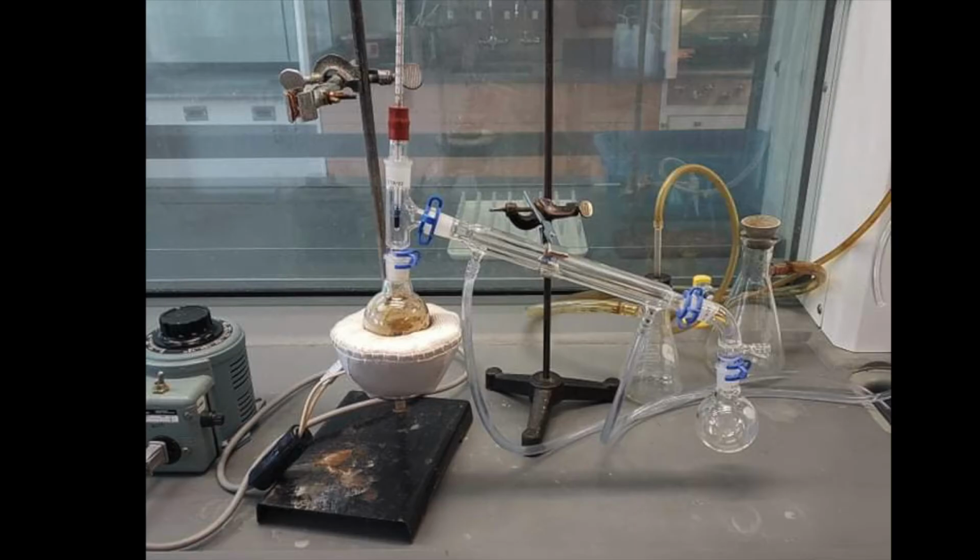While your spice is soaking, you can set up your distillation apparatus. Place your round bottom with your spice and water in it into the heating mantle. Fit it with a Y-shaped tube that also has a thermometer. The Y-shaped tube will then fit into your condenser. Remember, water goes in at the bottom and out at the top. The condenser will then be fit into the curved vacuum adapter, which will bring your distillate into the second 100 milliliter round bottom flask where you will collect your distillate.